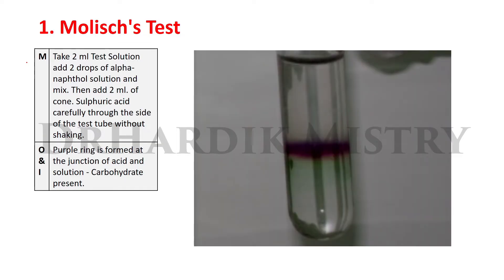Observation: A purple ring is formed at the junction of the acid and solution. Inference: Carbohydrate is present. That is the Molisch test.